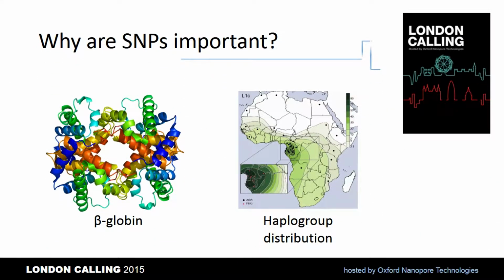While a single base change might not seem terribly important in the context of a megabase or gigabase genome, SNPs are important. First and foremost, SNPs are biologically relevant, being implicated in human diseases such as beta thalassemia and cystic fibrosis. Additionally, SNPs have also found use in evolutionary genetic studies and human identification.